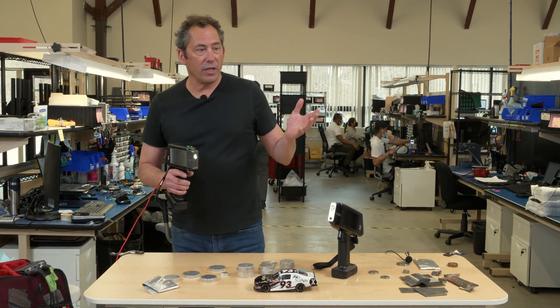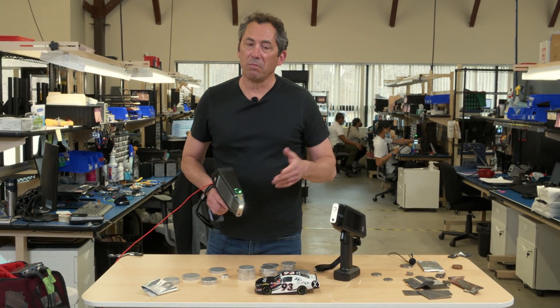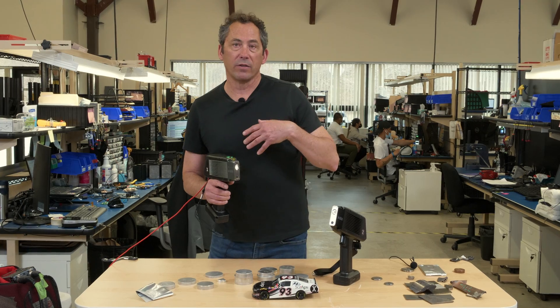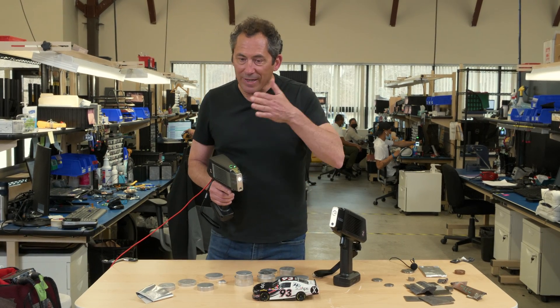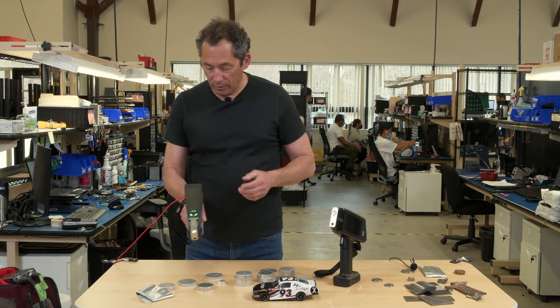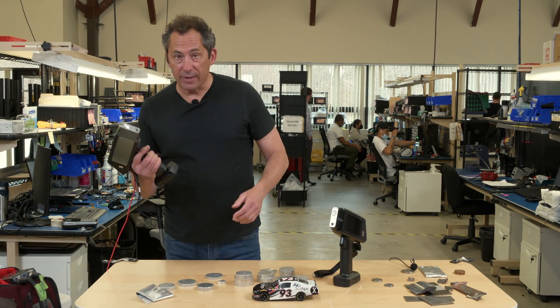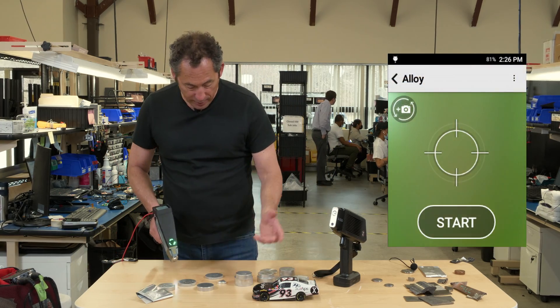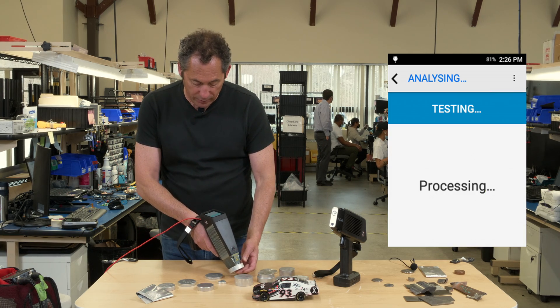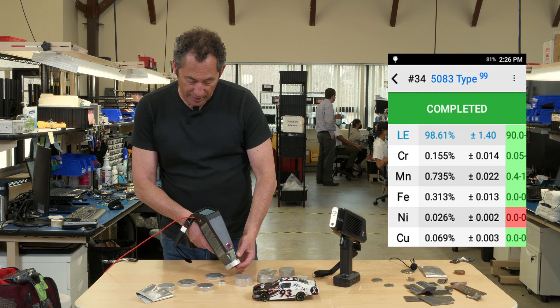The first way: if you just see a half dozen or a dozen different aluminum grades and you don't really want to sort them out precisely into grades, there's a really great quick way to do it. You set this thing up in a single beam test, and in one or two seconds it tells you the alloy — 5083 type.